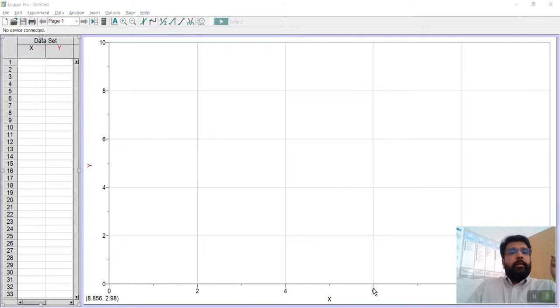Hello everyone, and in this video I'm going to explain how to use Logger Pro gel analysis software to analyze the gel image that you have created using your DNA fingerprinting activity or any other lab that you have done in the classroom. Now remember, this software is not available in your Chromebook, and it is installed only in our classroom computer. So you have to do it in the classroom.